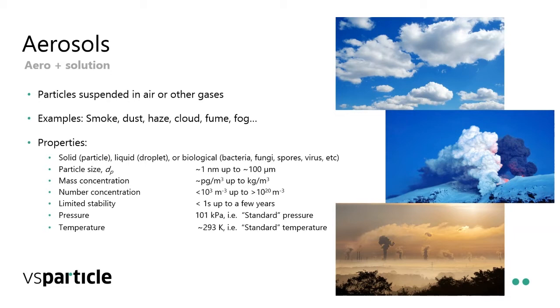Number concentrations can be very low, from a couple of particles per cubic meter in a clean room up to 10 to the 20 if you go right at the mouth of a volcano or at the top of a flame.